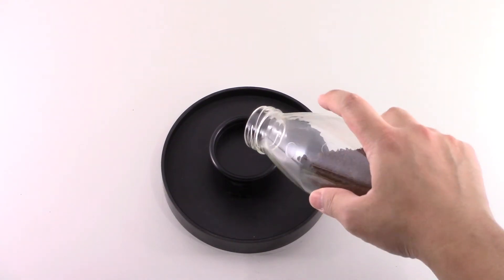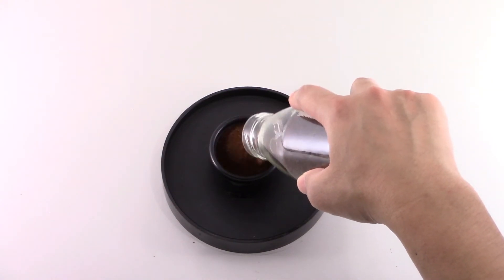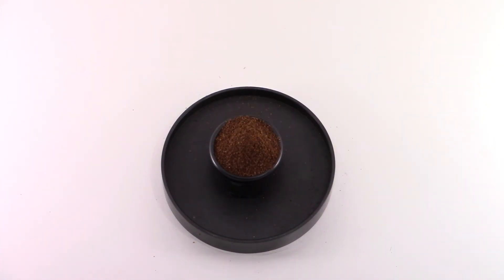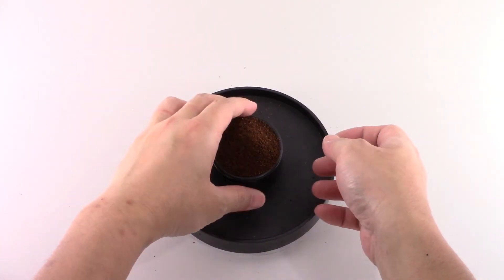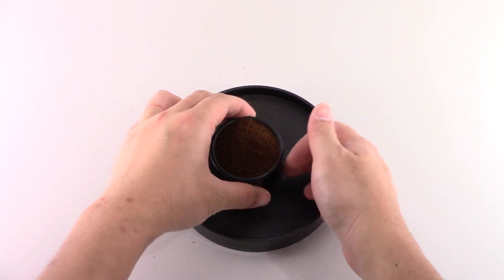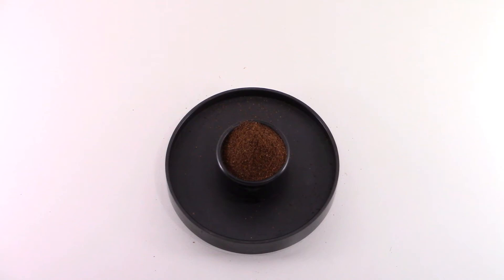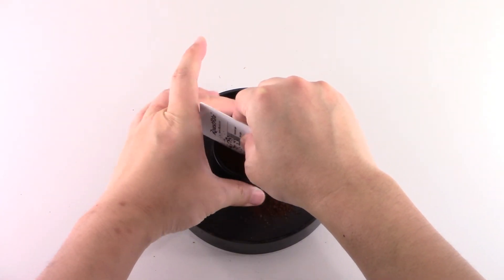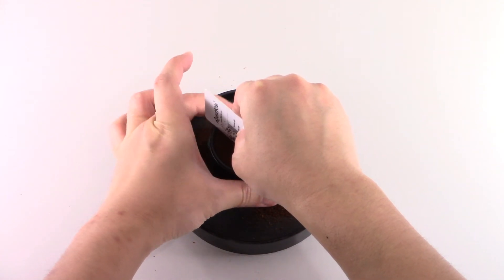Pour in around 20g of sample, just a bit over the top. We recommend using the same grind size that is used for cupping. Lightly tap the cup to help the grounds be more densely packed. Then place the scraper on the rim of the cup and rotate the cup to scrape off the excessive sample and flatten the surface.